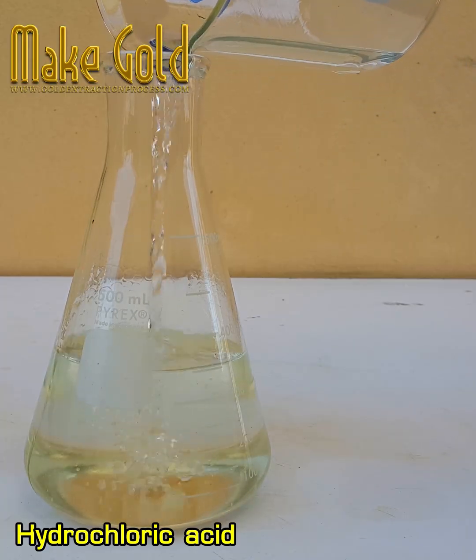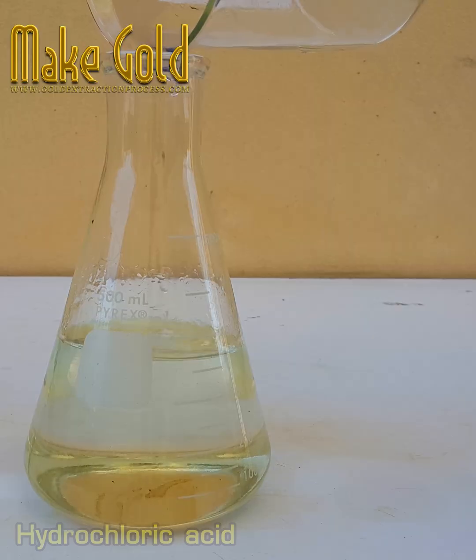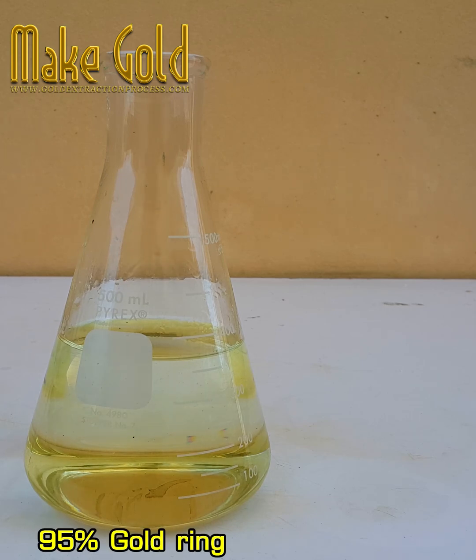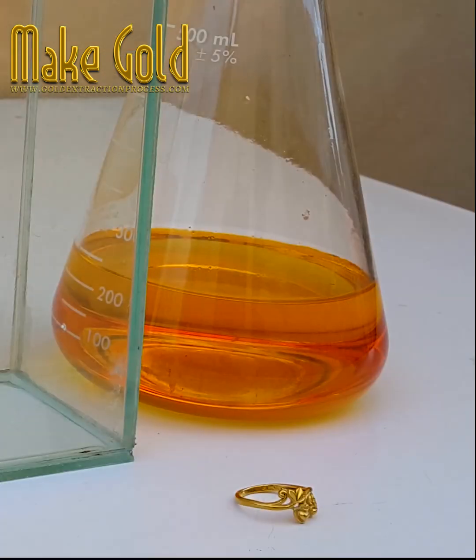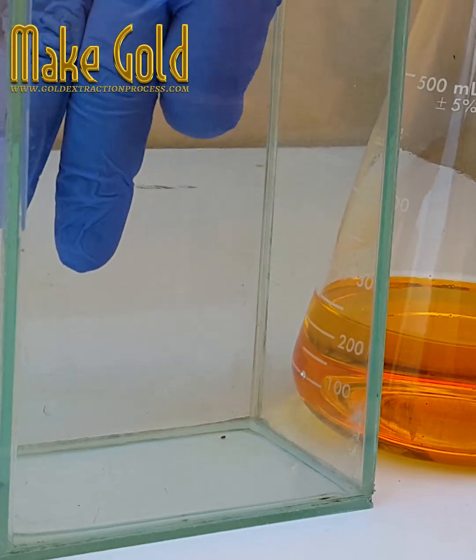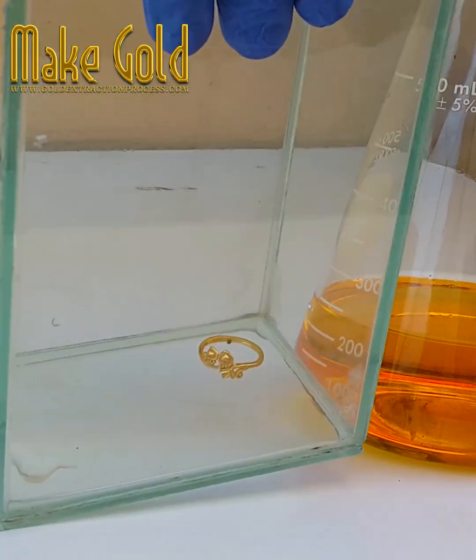The ratio between gold alloy and aqua regia is 50 grams of gold alloy to 200 milliliters of aqua regia. From my experiment, gold alloy was made into a solution at a temperature of 90 degrees Celsius to reach saturation point.